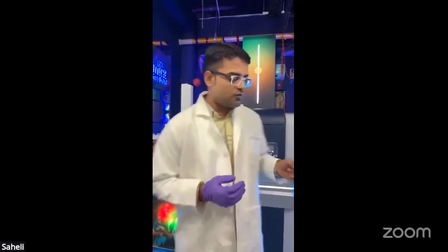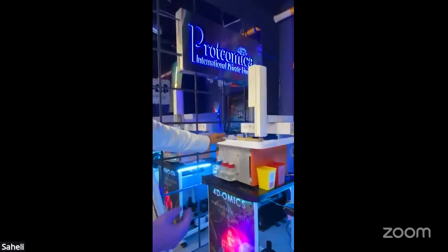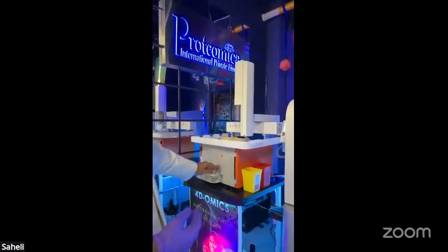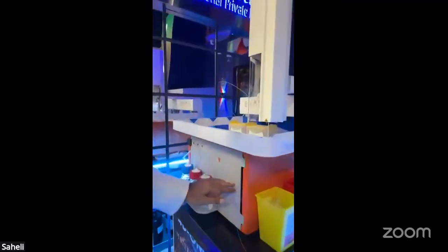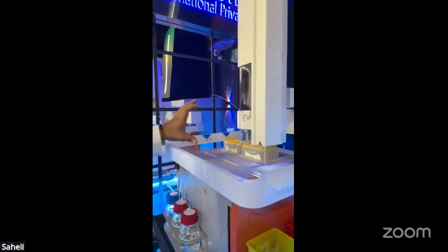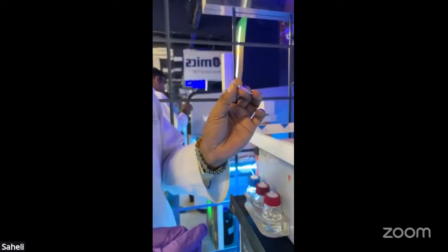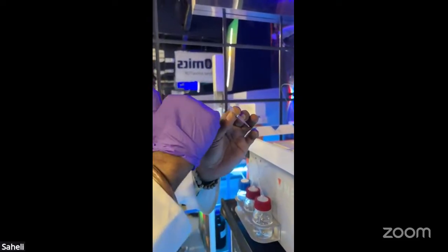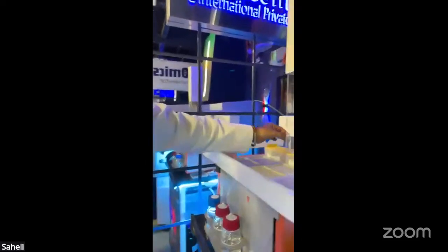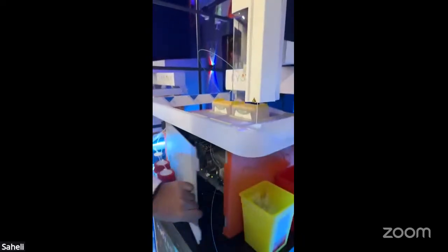So what you are finding is the timsTOF Pro instrument coupled with the EvoSep Nano LC. This EvoSep Nano LC is one of the cutting edge revolutions in the world of Nano LC. Here you don't have to keep different samples. You just have to put these tips, which are Evo tips. You directly load the samples and the samples will be directly eluted.